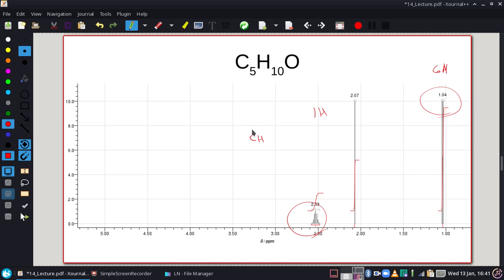Well, I have 3 more spaces here, so I could either have 3 CH2s, and that would work, or maybe it is just 2 CH3s. And then the other thing is just bonded to some other thing that we're not aware of yet. Now here's the weird thing.